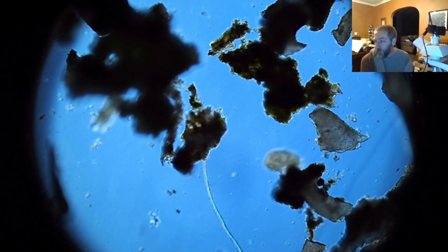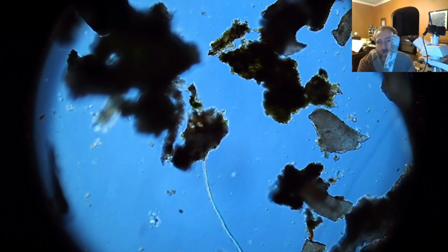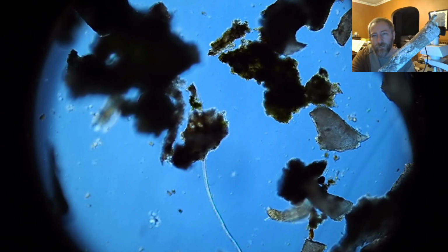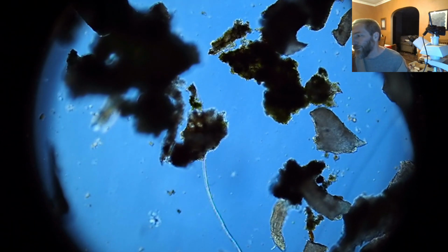Do you pick up sticks with different kinds of lichens to search for water bears? Yes. So the one that I was showing on the stream before was just this stick here. That's the one that I took samples from the last time I streamed from home. I just happened to have it sitting next to this box. You can sort of see that's a really old stick with mostly a white colored lichen on it. And that seemed to generate a fair number of water bears.